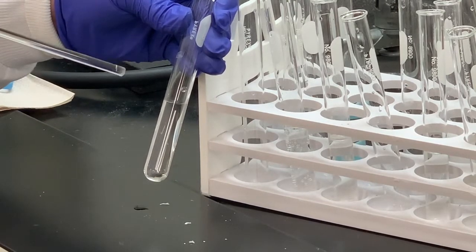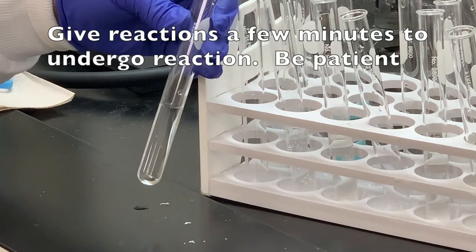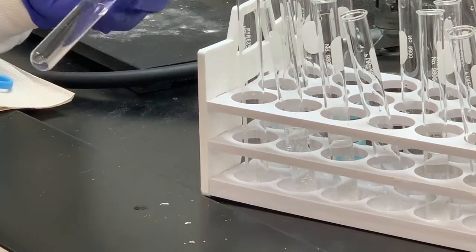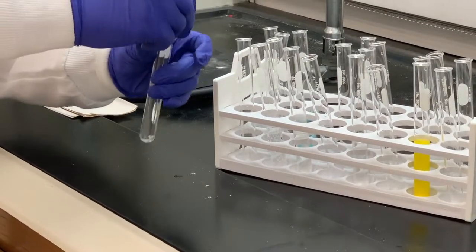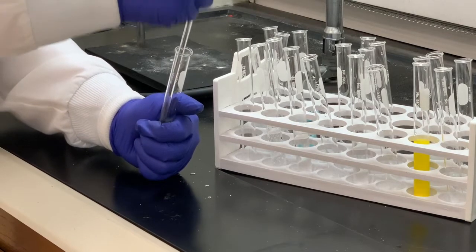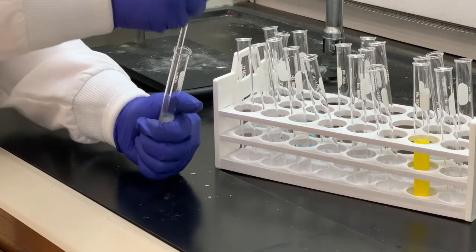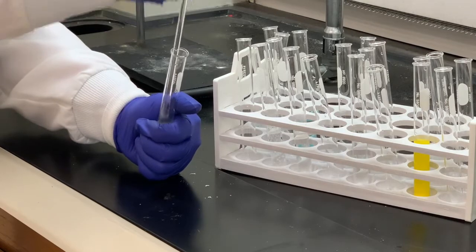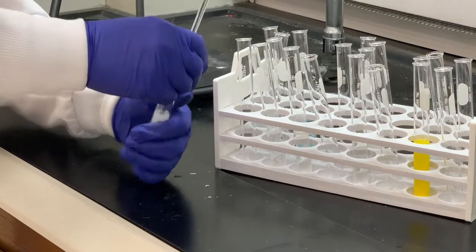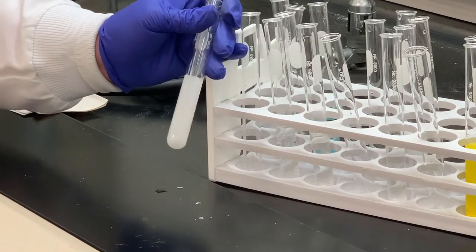If you were doing this on your own, if a reaction didn't occur, you would want to give it some time. I know ahead of time which things are going to react and which ones don't, but if you don't, you always need to give it that extra time. So all I'm going to do is to take a stirring rod, and I'm just going to hold this, and I'm scratching the sides of the test tube. What I'm trying to do is to force those ions, because remember, they're all spread out in that solution, to get together so that they can combine. And if you notice, now we have formed a white precipitate.